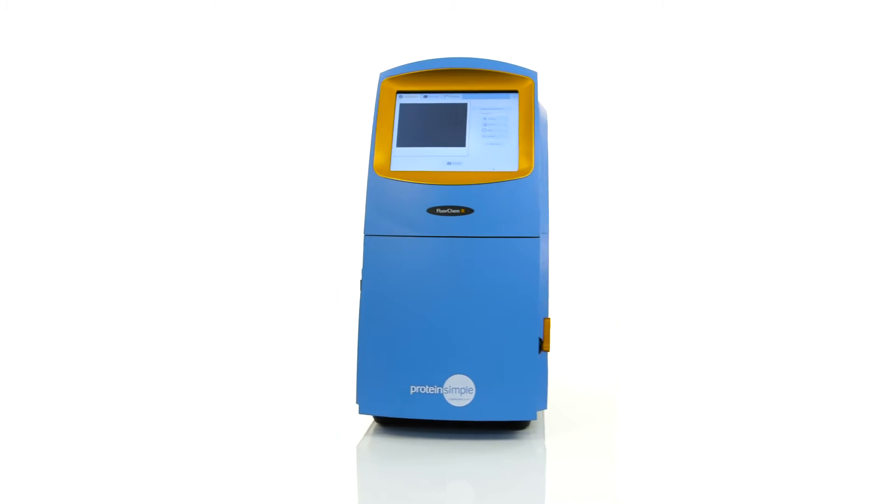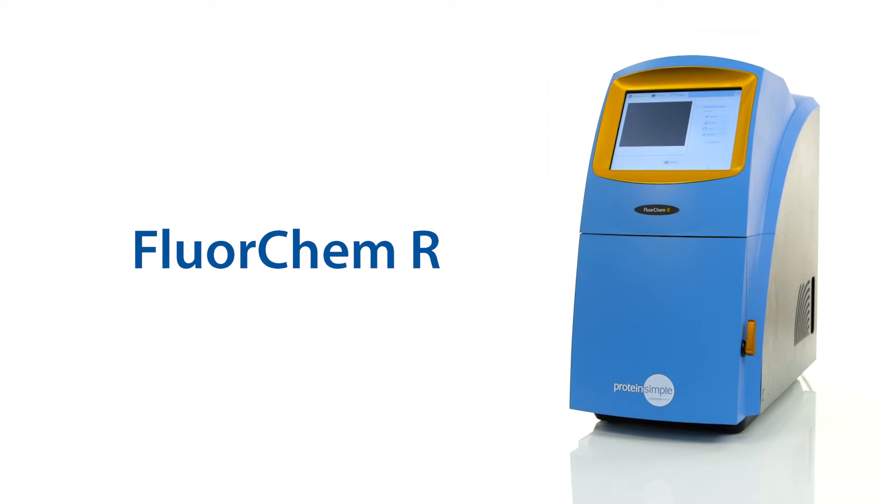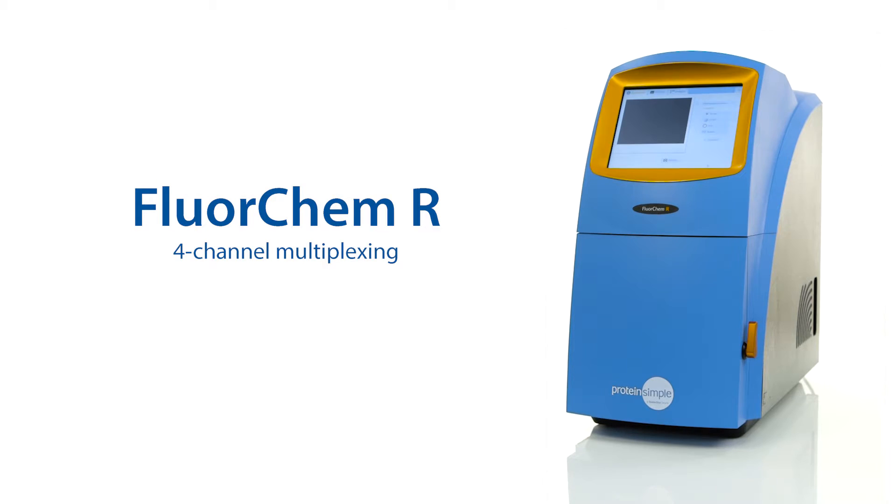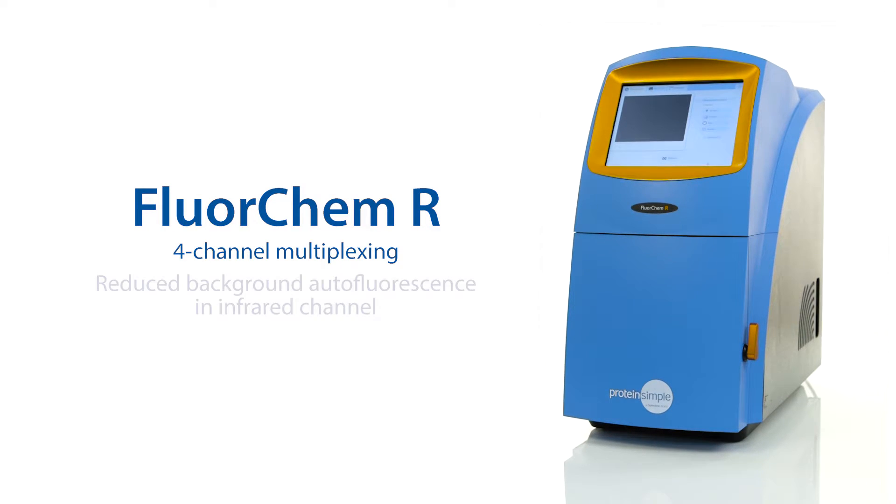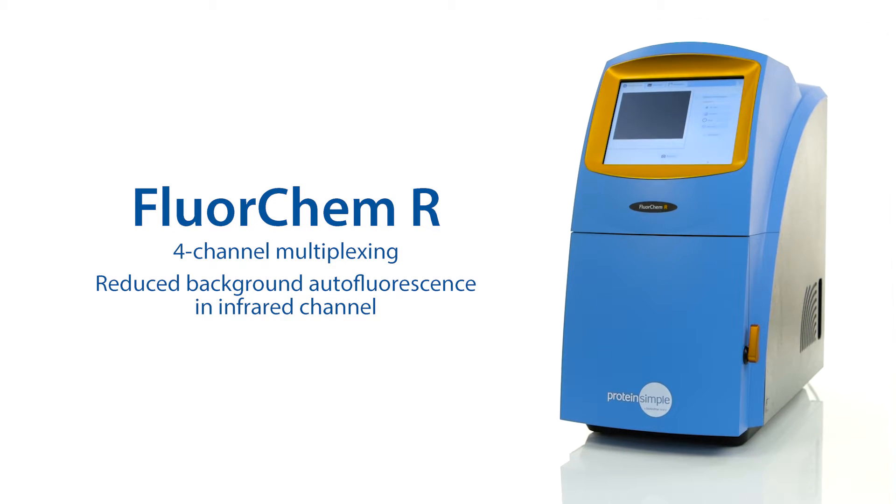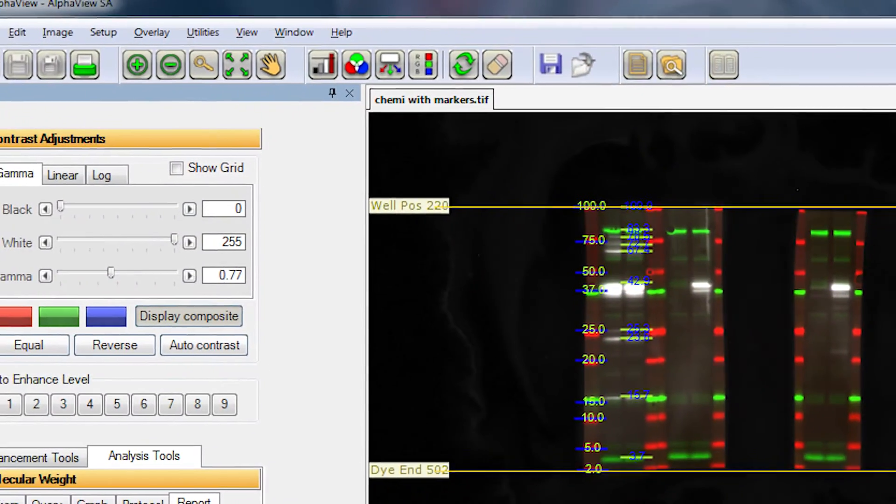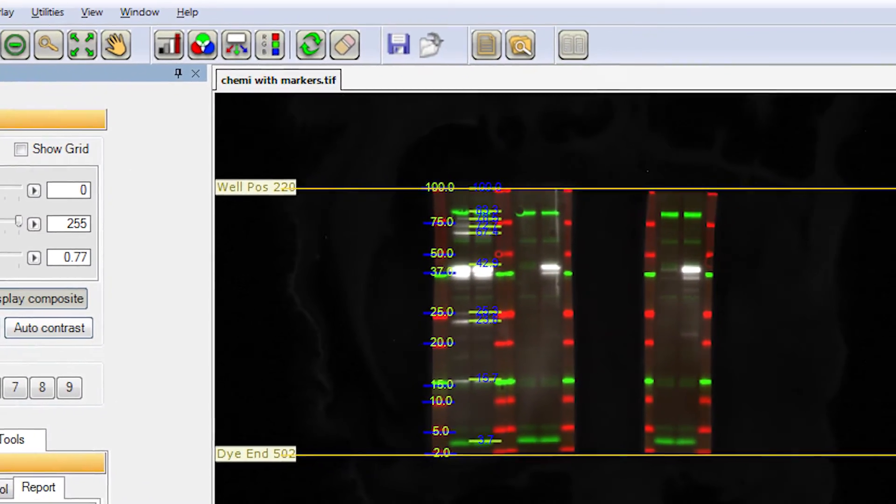With infrared excitation and detection, the FluorChem R system gives you four-channel multiplexing, with reduced background autofluorescence in the infrared channel. With easy-to-use software, taking high-quality images is a breeze.